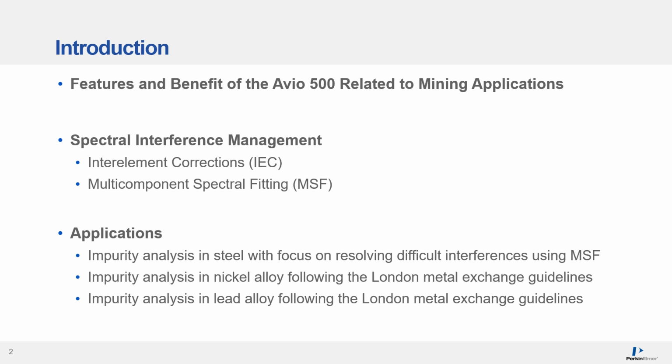Analysis of pure metals and alloys by ICP-OES requires some level of interference management, as these are usually looking for trace level of contaminant in metal concentrates. We're going to speak about some of those applications later on in the talk.